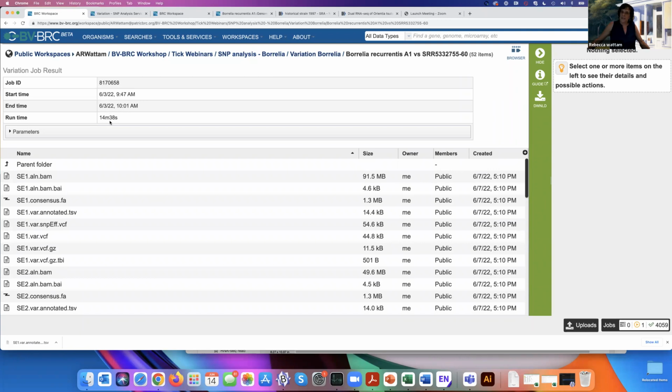And you notice I put 6 read files in there. You can put as many as you want in to compare it. But when you do that, remember that you're going to have to analyze it. So if you have 100 things in there, Godspeed and good luck. So the first thing I want to show you, up here, is the genome browser.